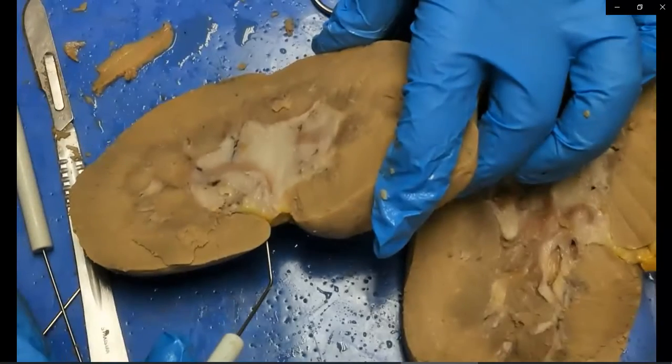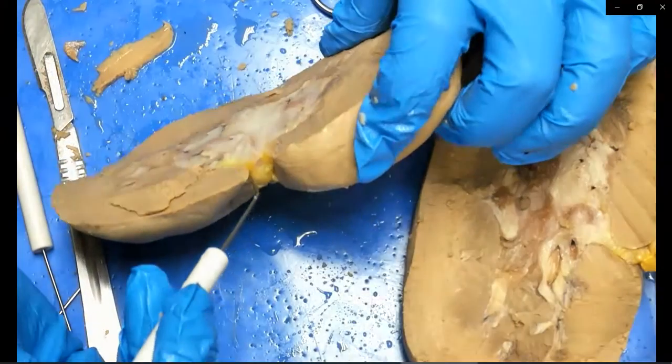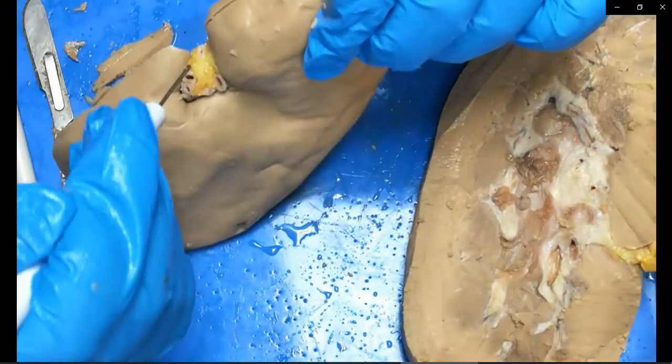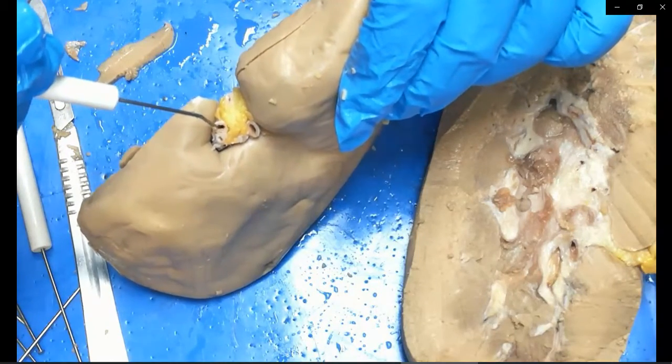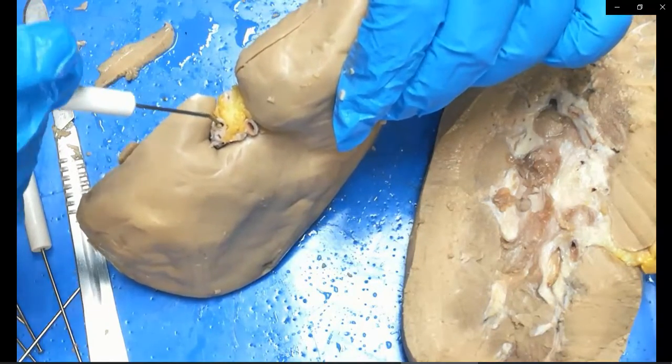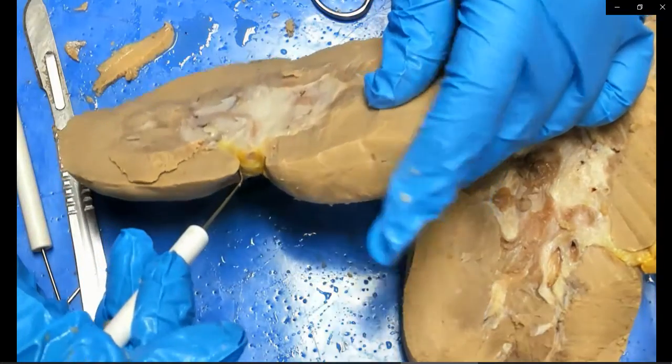Hold on. Let it focus. There it is. Okay. So again, there is your artery right here. And it's nice, round, thick, and meaty, so we're going to follow it in with the probe.